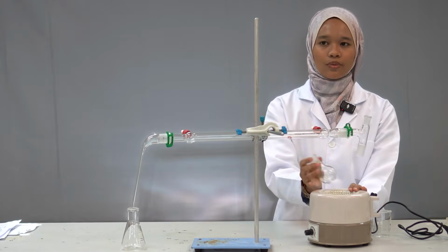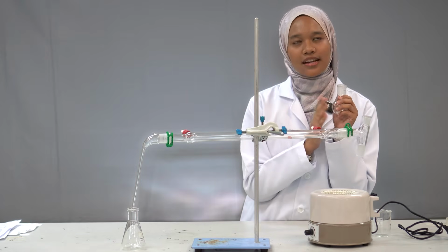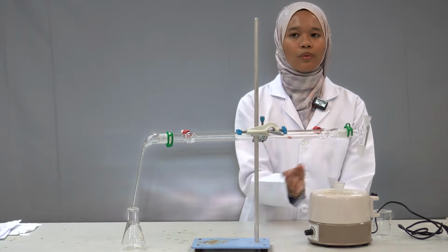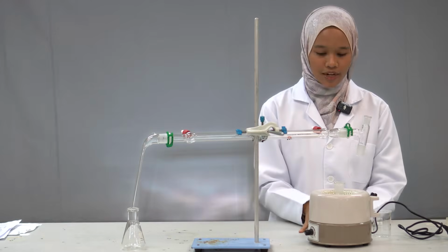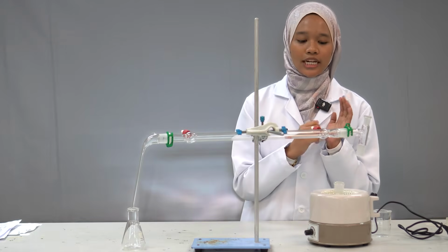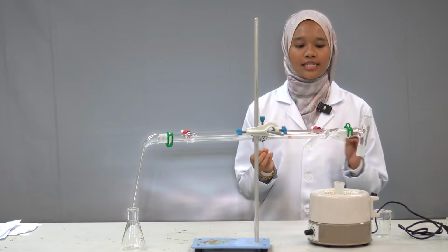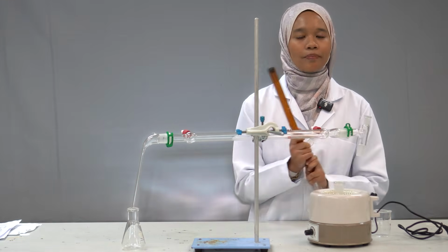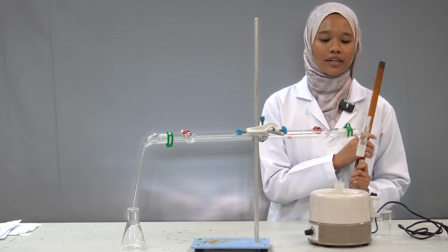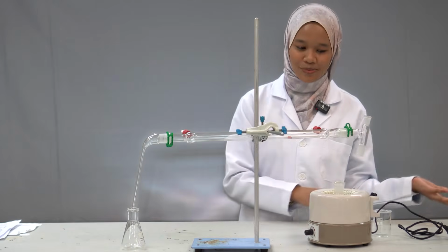Next we have the distillating flask, or round bottom flask. We name it the distillating flask. We will put the mixture into the distillating flask. After that, we will put in the boiling stone. The boiling stone's function is to make sure that the mixture is not superheated. And then next, we will have the thermometer. The function of the thermometer is to let us know the temperature of the mixture during the experiment.